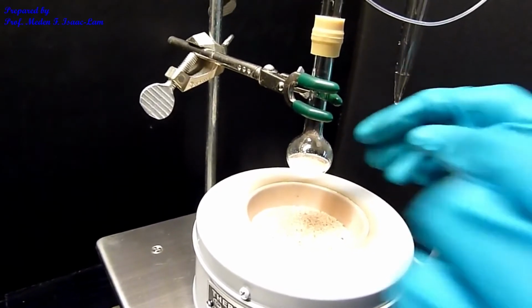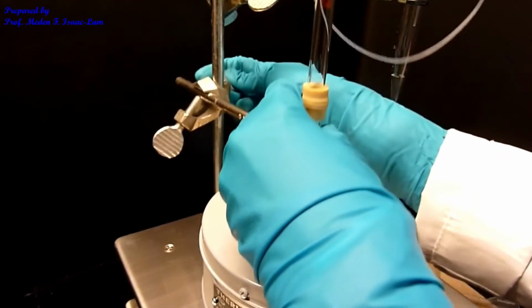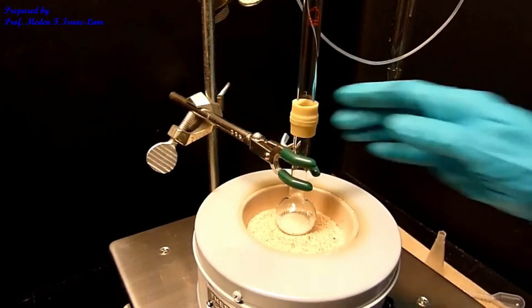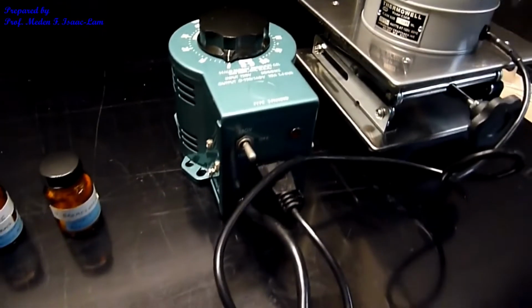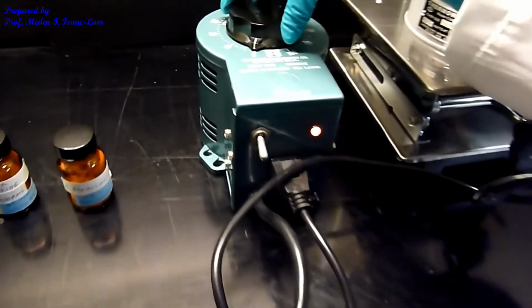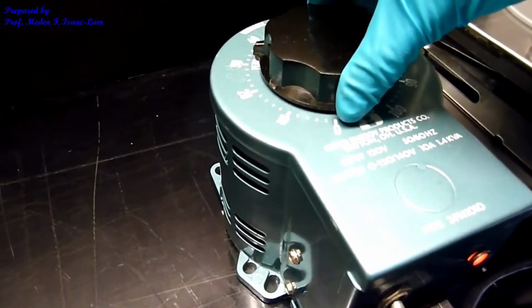So we're now ready to reflux, and I'm going to lower it down into the sand bath. So I'm going to set it so the sand bath is connected to the transformer. Connected to the transformer, I'm going to set it to 120 volts, and I'm going to set it first to about 35.